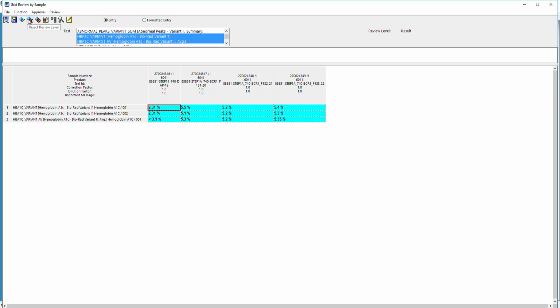These buttons here, approve results, reject results, and things like that, they show up in the formulation role, but they're inactive. But please stay away from these things. They shouldn't do anything, but I don't want to break anything in the system. But this is an easy way to go through and review results.